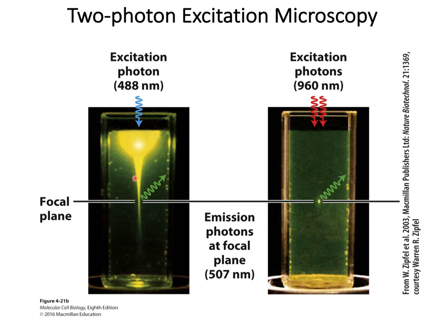So that background will interfere with the emission spectrum from that single plane of focus, even in the presence of a pinhole of the confocal microscope, which is supposed to cut out of focus light. It is just a limitation of the instrument in the case of a thick sample.